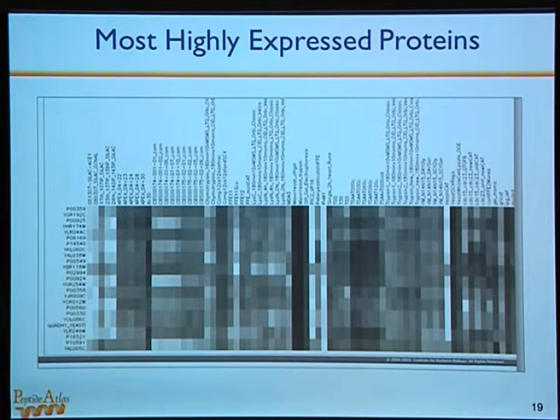Also on the builds page is this heat map, which shows for the top 25 proteins in this build what their distribution is across the samples. In some cases it's interesting. For instance, this particular sample has this protein, or these two proteins, expressed at a high level. Sometimes these may be synonyms. You can see the accession spaces are different: this is an SGD accession, and this is a UniProt accession. Since they're in lockstep, it's very likely they're the same thing. But this gives you an overview of which proteins are most highly expressed.